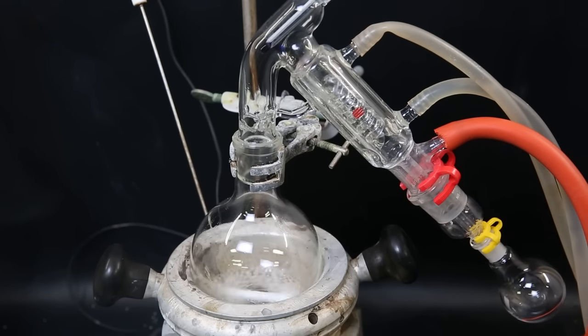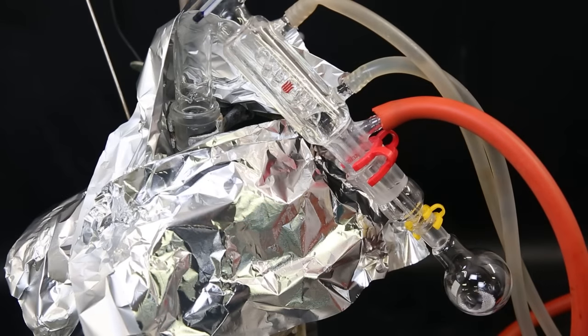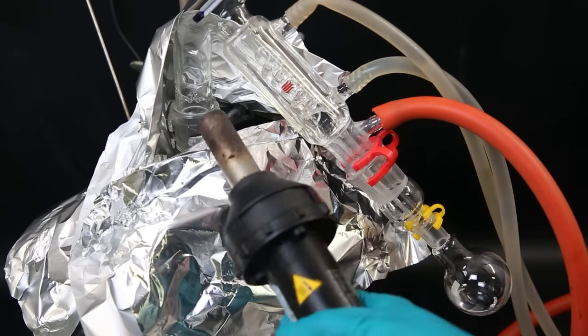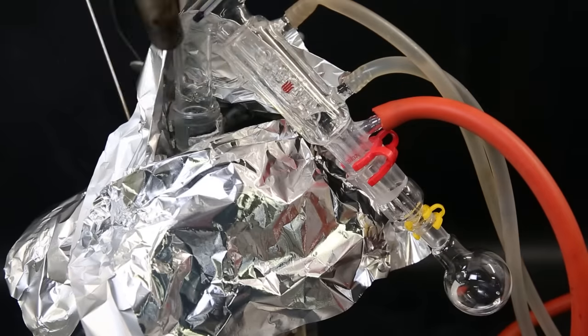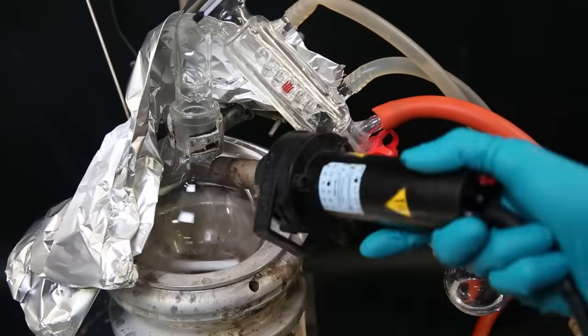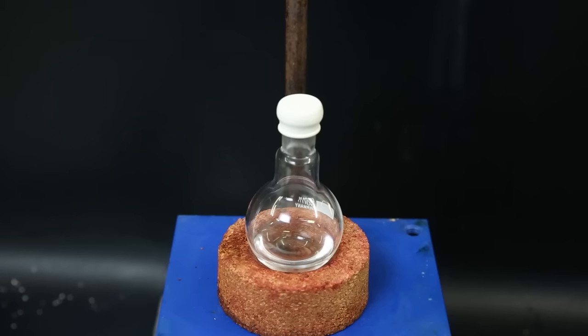Tetrabutyl tin has a high boiling point, so I increase the temperature, pull a vacuum, and insulate the flask with some aluminum foil. I also assist the distillation with a heat gun, and after a bit, the tetrabutyl tin starts coming over. After a while, I collected all of the tetrabutyl tin and the yield turned out to be 82%.